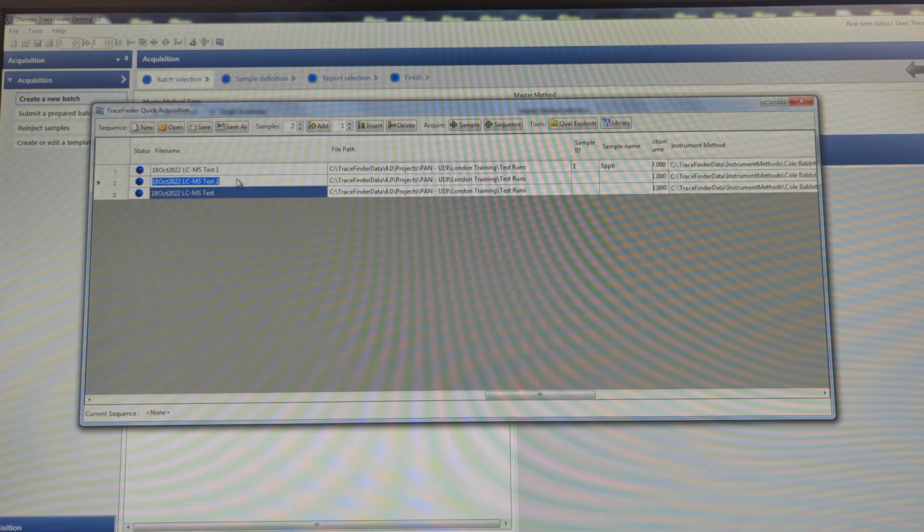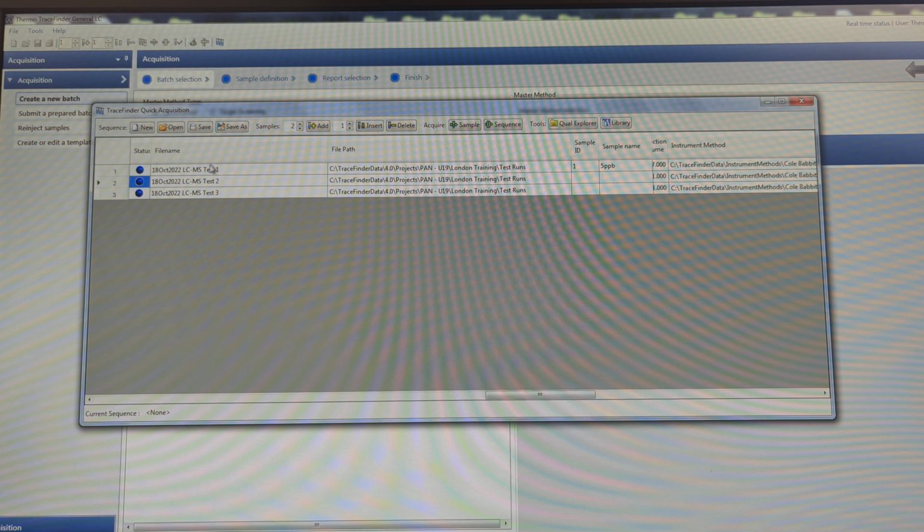However, it did 01, and it labels this test here. So keep this in mind. This is something I do not like, and I'm going to clear it. Now, something that is nice is if I hit 2, I can actually highlight this cell and the one below it, saying I want this one and the one below it, and I can tell it to fill down or copy down. If I hit fill down, it keeps counting.